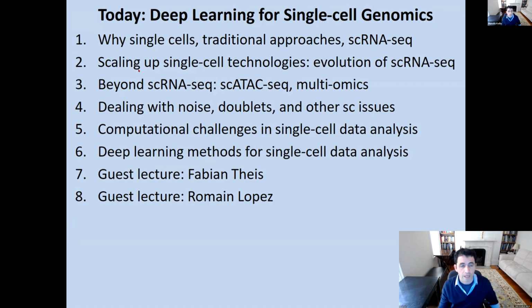We're going to talk about how single cell technologies evolved, giving rise to today's technologies through three main paths. Then we're going to talk about how we go beyond RNA with single cell ATAC-seq and multi-omics at the single cell level. Then we'll talk about how to deal with noise, doublets, and other single cell issues. Then we're going to classify the different computational challenges in single cell data analysis and talk about some emerging deep learning methods for single cell data.